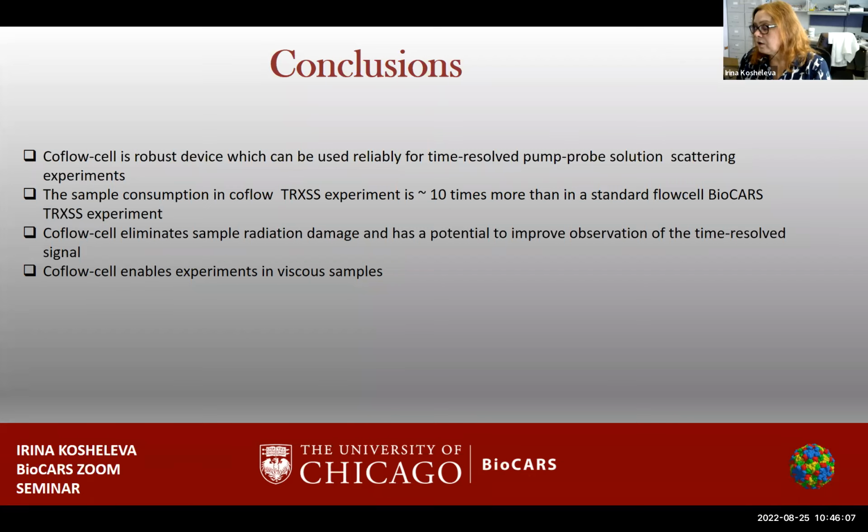The caged protons were used, and then we used UV light to basically release the protons. And in this sense, it works like a standard pump-probe experiment.